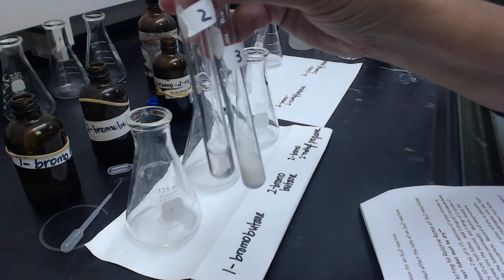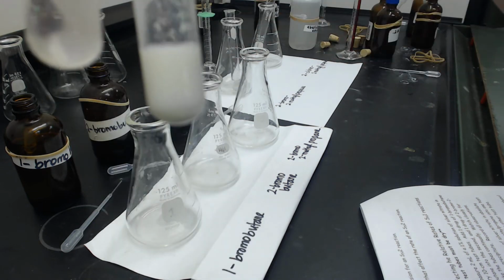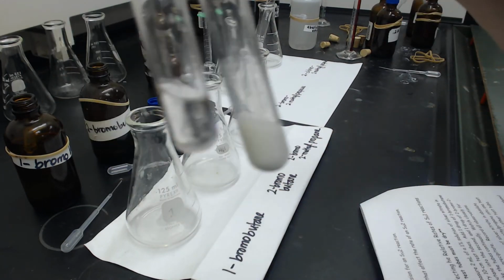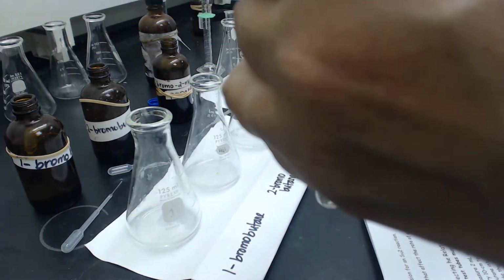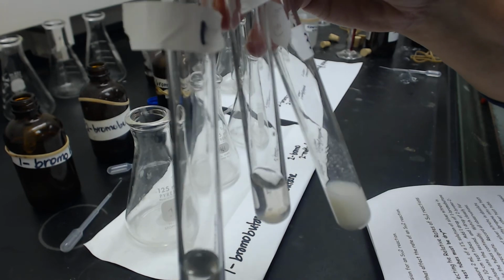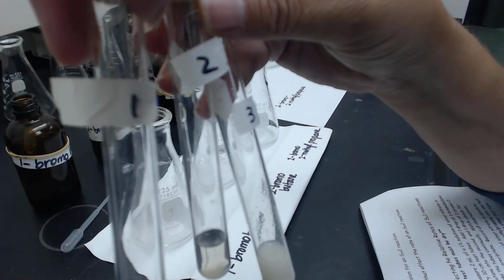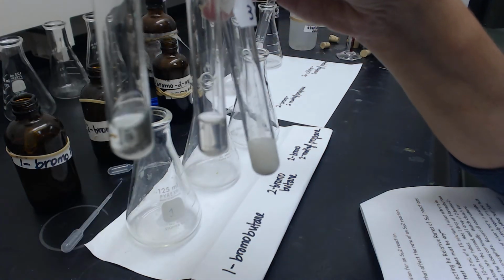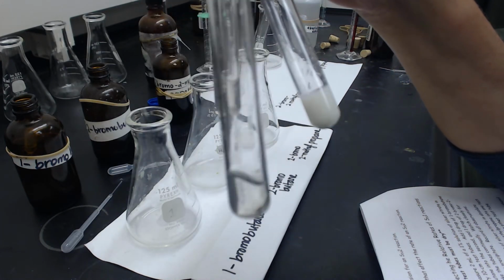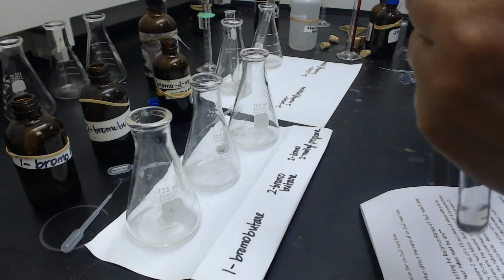Already you can see that this one, number 3, turned white almost immediately. So that precipitate is what we're looking for to show that a reaction has happened. So almost immediately the 2-bromo-2-methylpropane precipitated. Number 2, the 2-bromobutane, which is secondary, is starting to cloud a little bit.